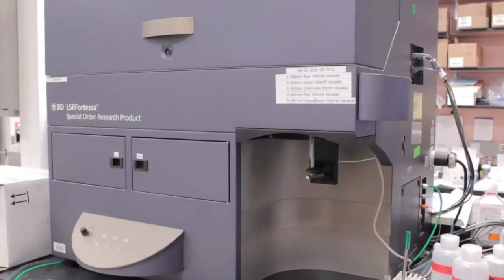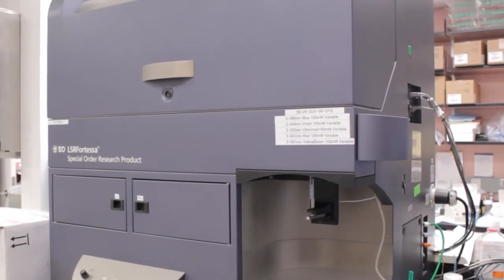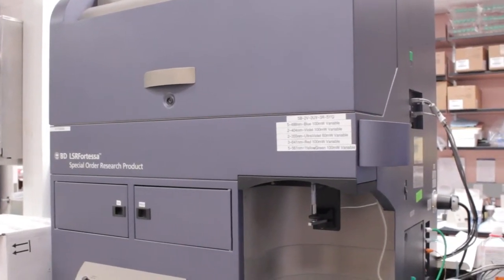Hello, my name is Daniel Osorio, and my research tool is called the flow cytometer, which is used for cell sorting, cell counting, and biomarker detection.